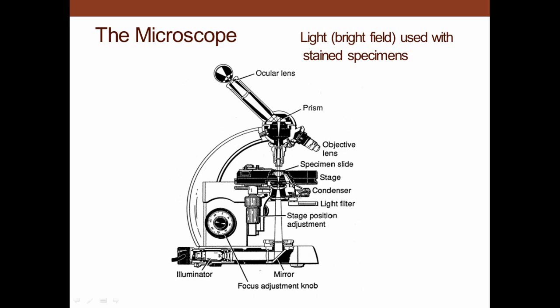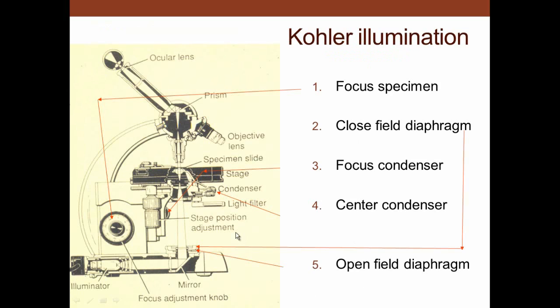Below the stage we have a condenser, which condenses the light going onto the specimen so you're able to view this with your eye. The light source coming through here. Here are the focus knobs. The coarse focus in the middle and the fine focus on the outside, and then there is the bulb.